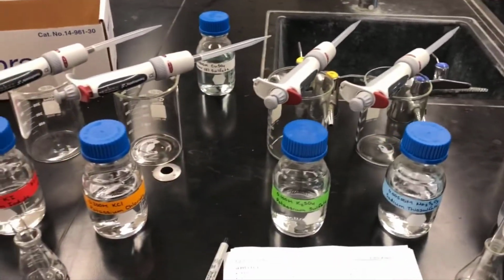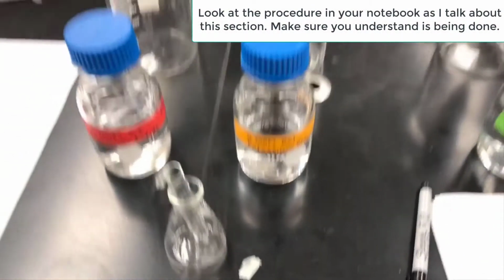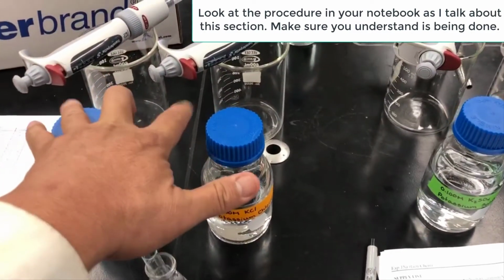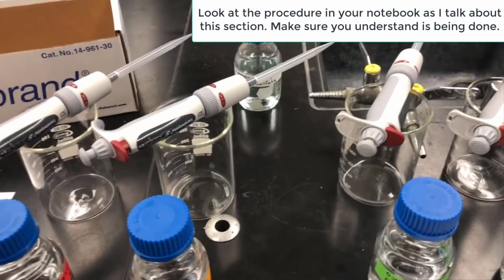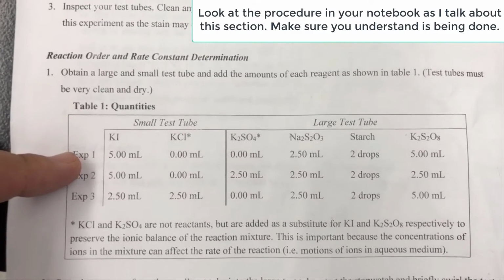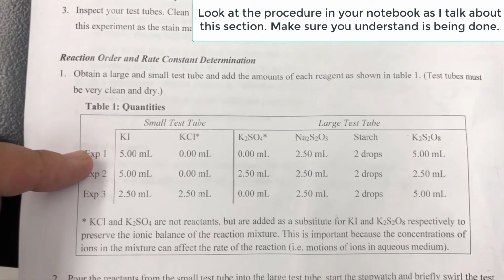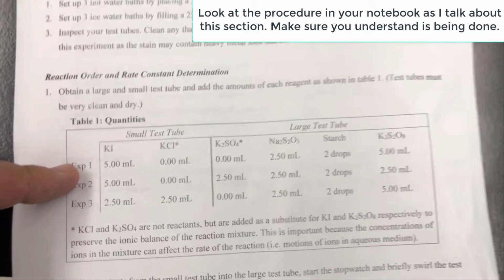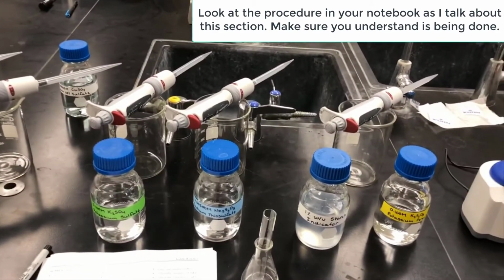Each one of those pipettes represents one of these solutions. You'll notice I have the test tube here. These are my solutions. Each one has its own pipette. Now the pipettes are set to 2.5 milliliters because as I looked at this table, I noticed that everything was in increments of 2.5. And so if I set them to 2.5, I don't have to reset them to 5. I'll just do those twice, okay? This is the next set of solutions. I'll have to back up because there's a lot of them, right?